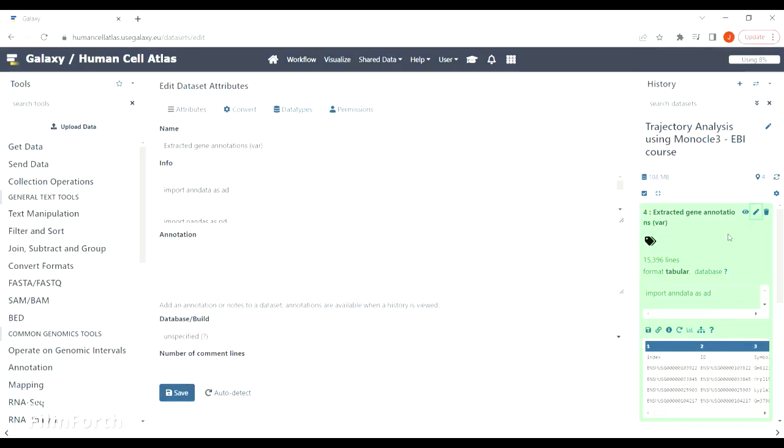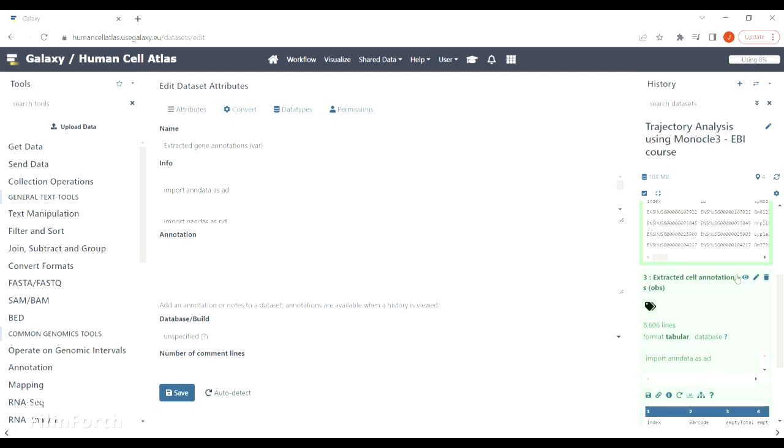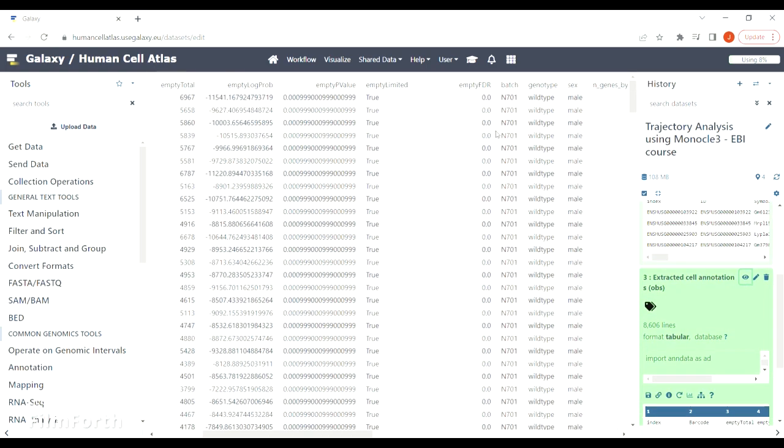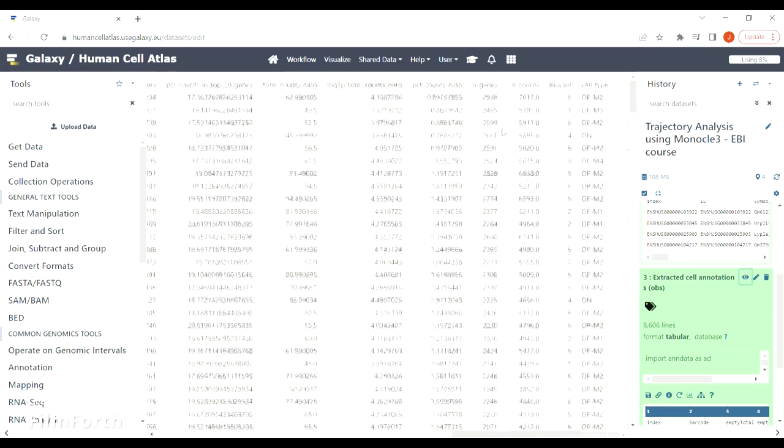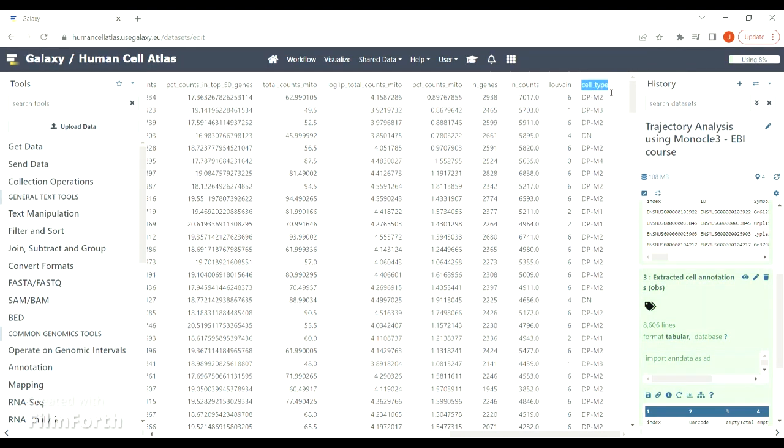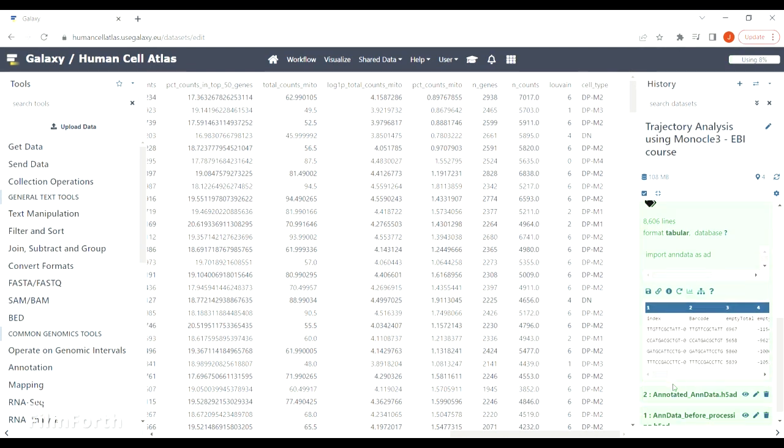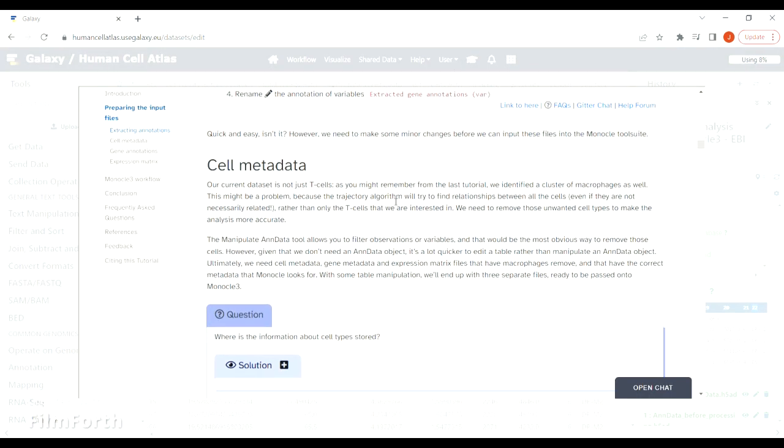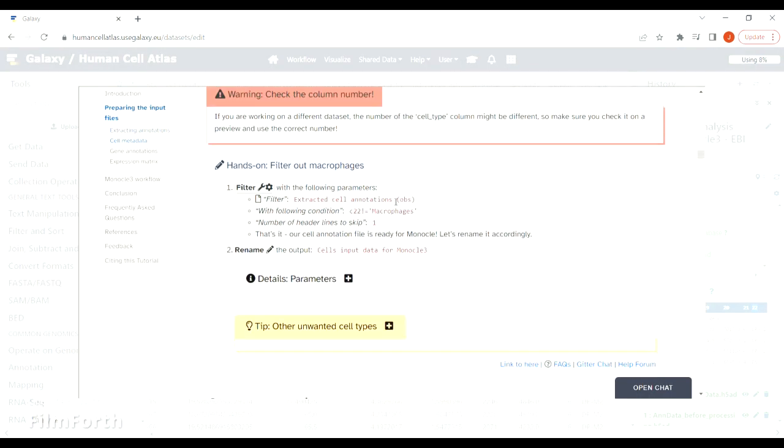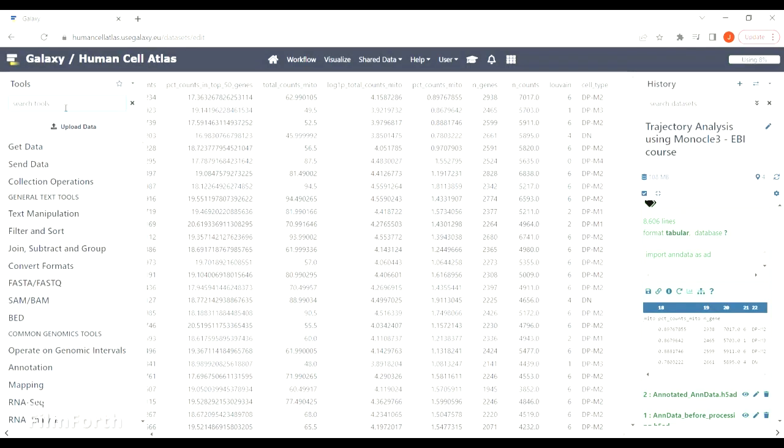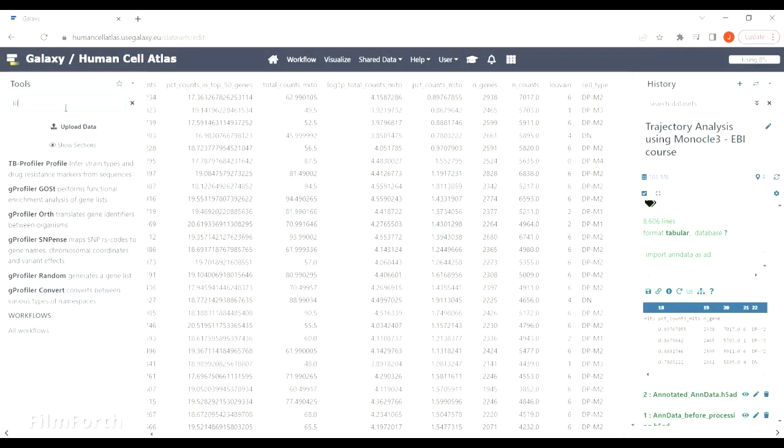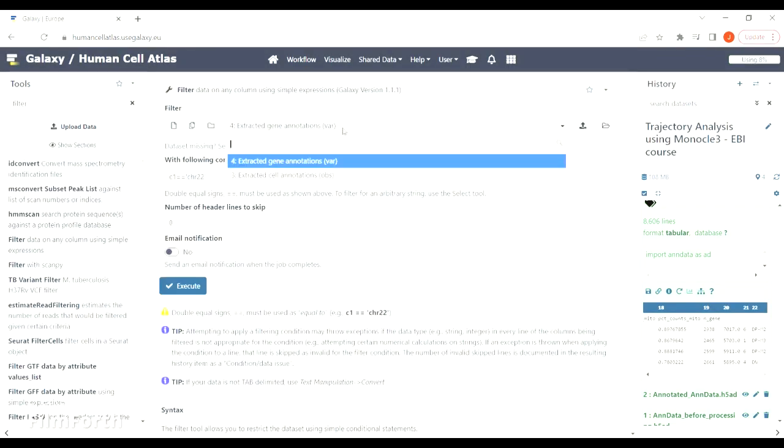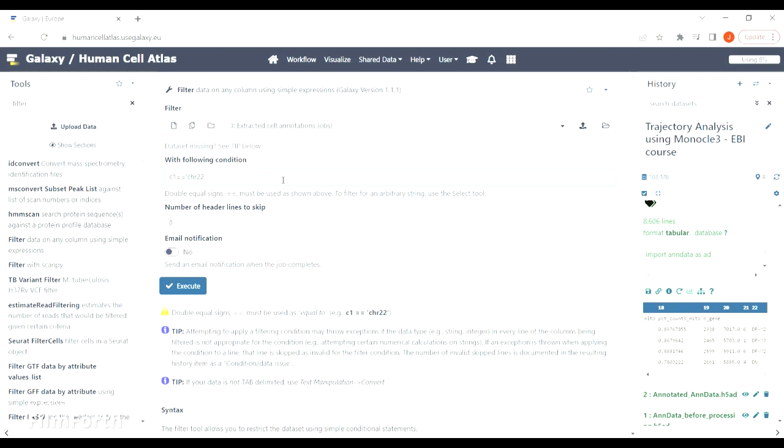We are going to remove macrophages from our dataset, so the information about cell types is stored here. To check the number of this column, you can look at this preview window. We can see that in our case it's number 22, so keep that in mind. Check which tool we are going to use next, find it, and specify that we are going to filter out all macrophages from column 22.